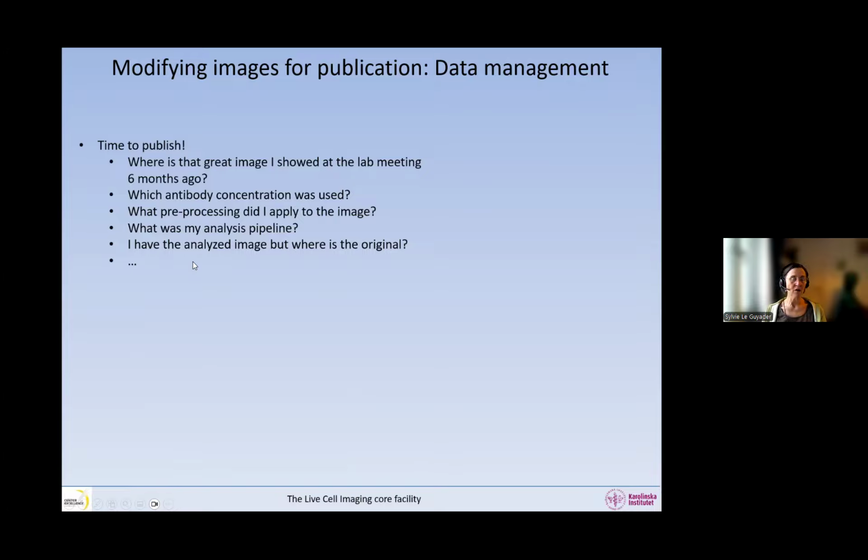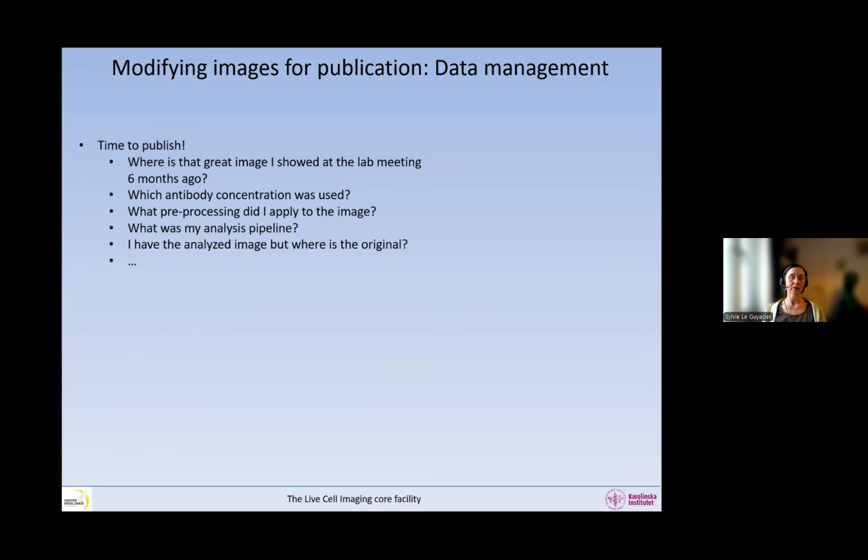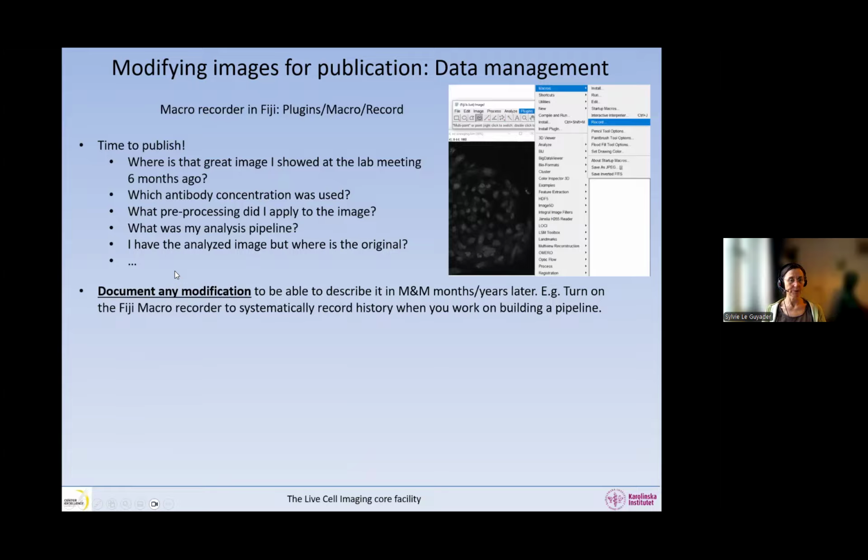So this is now that you need to think about data management. It's not once it's time to publish. Make sure your data is organized properly, that you always save the original, and you can save whatever you have transformed in the same folder. You need to have a way to find the original. So for this, OMERO is fantastic, because you can work on the original image and then make a figure modifying the image, so showing the image modified without actually modifying the original. So it is a very, very great tool.